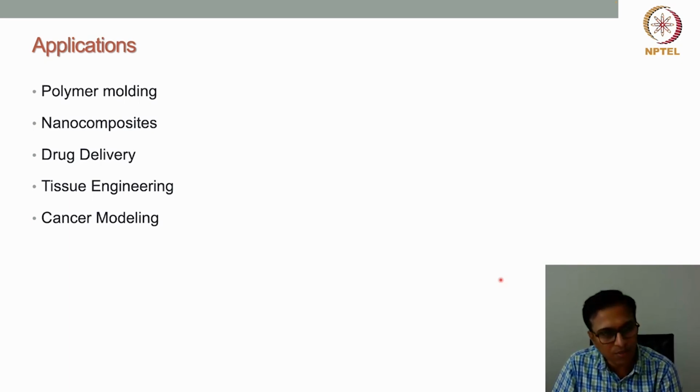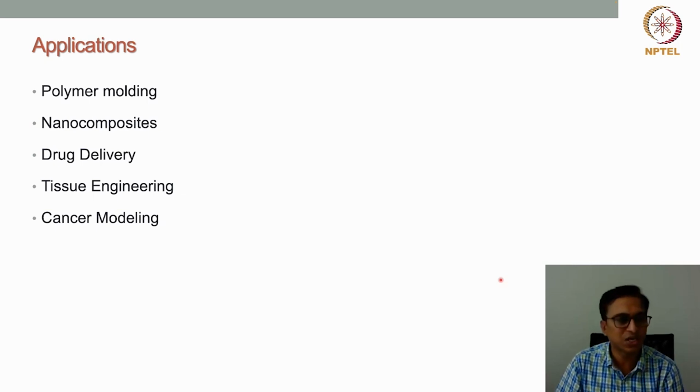For preparing nanocomposites, inkjet 3D printing is also used nowadays, because the nature of this printing technology is that it can create very fine droplets. So by creating those fine droplets, we can create very fine structures, or very fine particles, right? Suppose we want to mix two or three materials together. Then we can mix them, generate these droplets, and then generate the particles. So the composites can be of nano dimensions, and can be very well prepared.